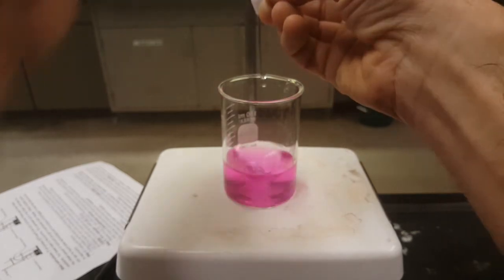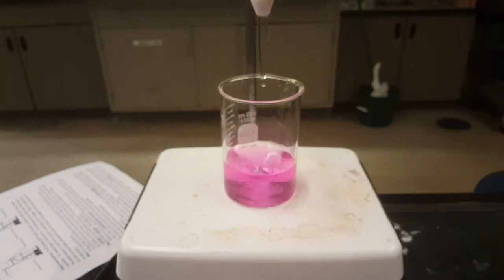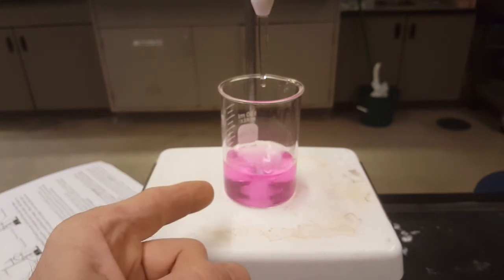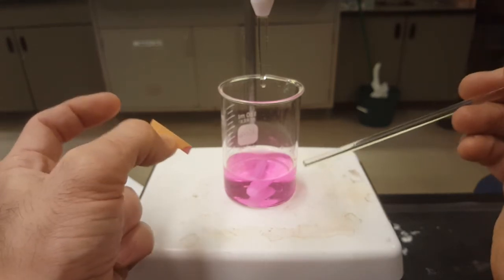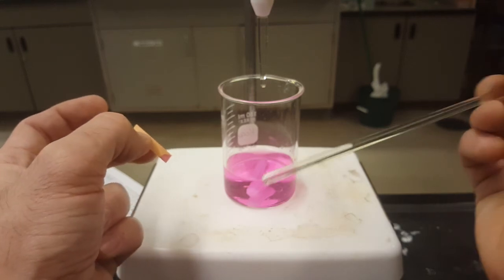Ooh, that was a single drop to shoot the pH through equivalency. One single drop of base, and now my color isn't changing back. Once your color doesn't change back to clear, you're done titrating except for the mathematics.